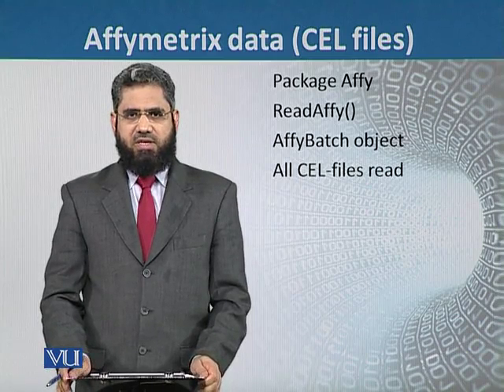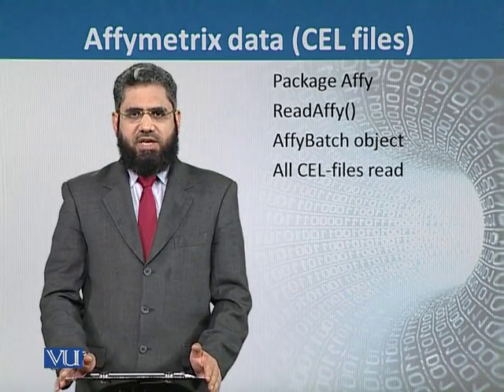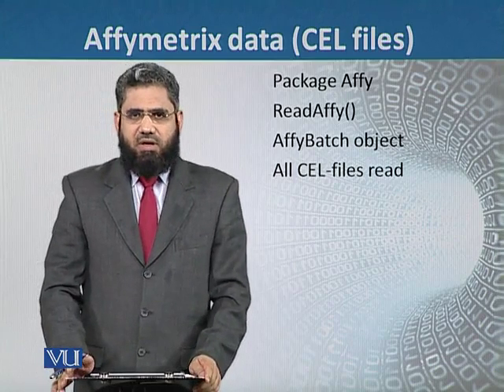After treatment with these dyes, the cDNAs will become either green for normal or red for disease.